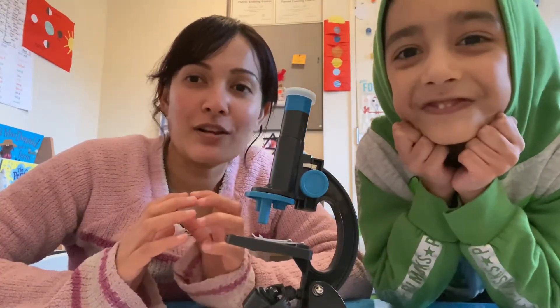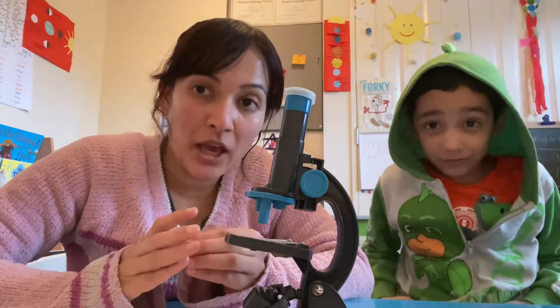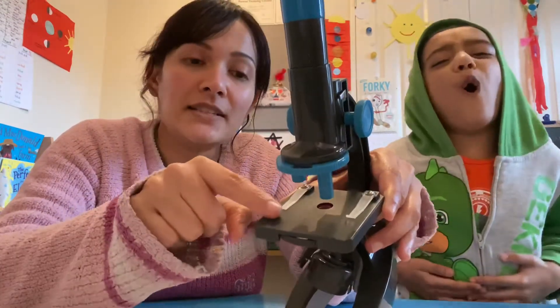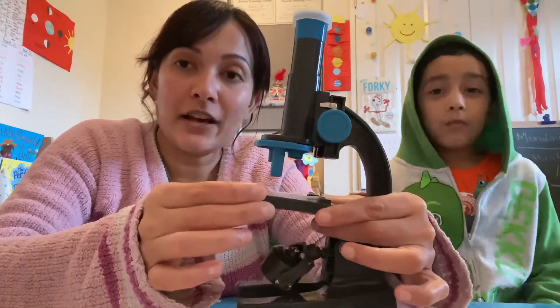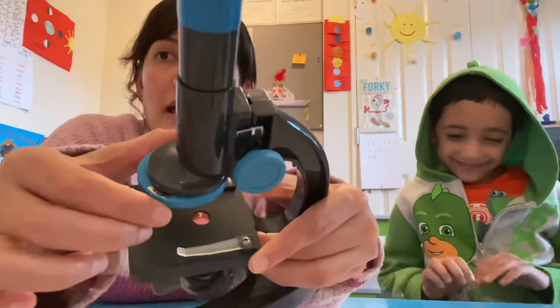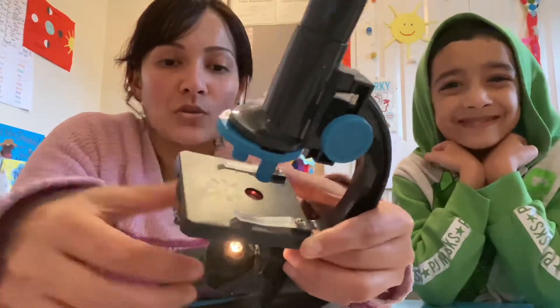After using your microscope, make sure you wash your hands with soap and water, and also wash any tools or accessories used to prepare specimens. Always handle with care when inserting the slides, and adult supervision should be required at all times. On the microscope we have 50x, 25x, and 100x magnification options.